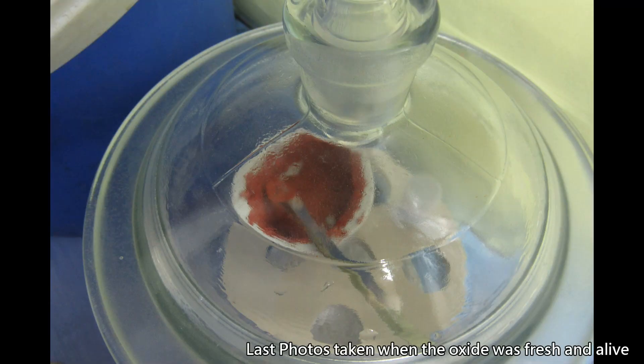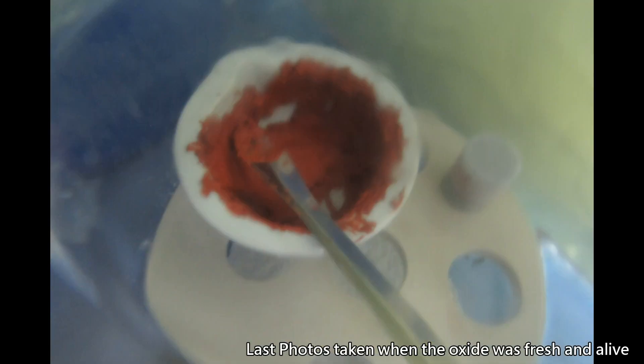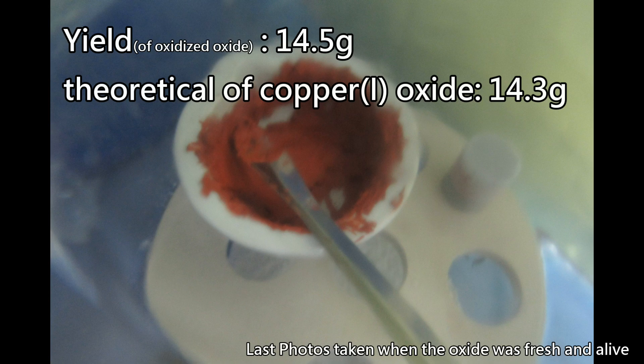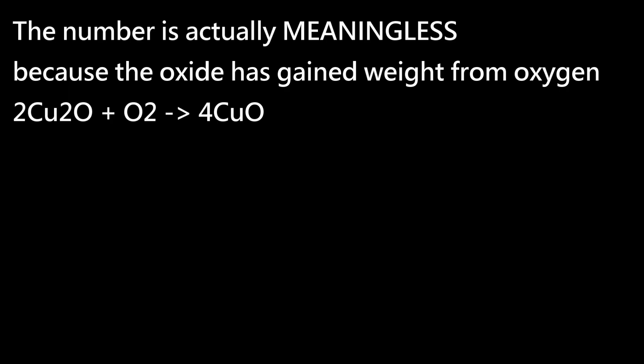Unfortunately, since I was super busy in the week after doing the synthesis, my copper oxide oxidized and turned from dark red to black. Anyway, the mass of the blackish oxide is 14.5 grams, while the theoretical yield is 14.3 grams. Based on the amount of copper sulfate used, the number is actually meaningless as the oxide has absorbed oxygen from the air and has gained weight.